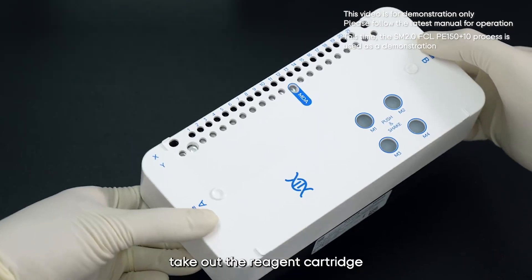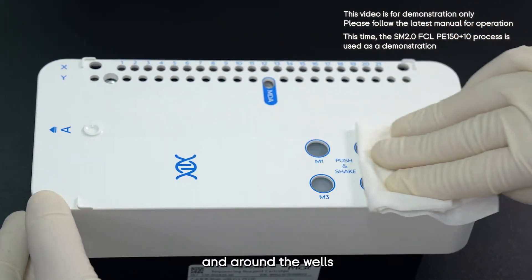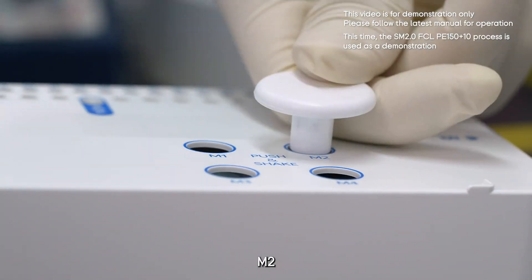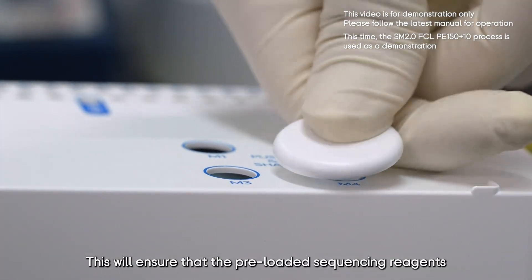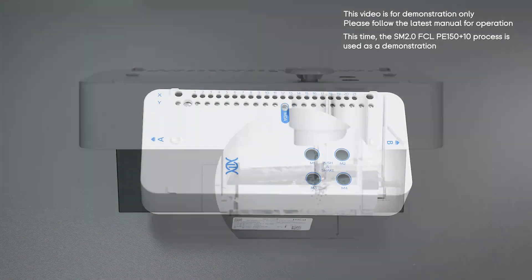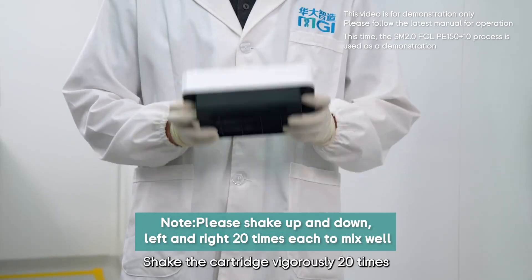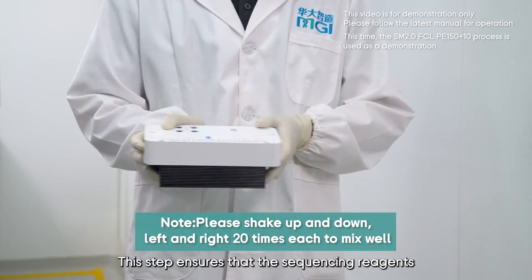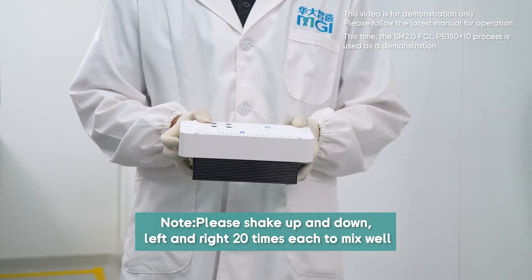Remove the outer packaging bag, take out the reagent cartridge, and check that it is intact. Use dust-free paper to wipe off any condensation on the cover and around the wells. Then take a puncher from the reagent kit and sequentially press down on the M1, M2, M3, and M4 wells of the reagent cartridge. This ensures that the pre-loaded sequencing reagents and sequencing enzymes in wells M1 to M4 drop into the corresponding wells containing the sequencing buffer. Then hold the cartridge on the A and B sides and shake it vigorously 20 times up and down and 20 times clockwise and counterclockwise.